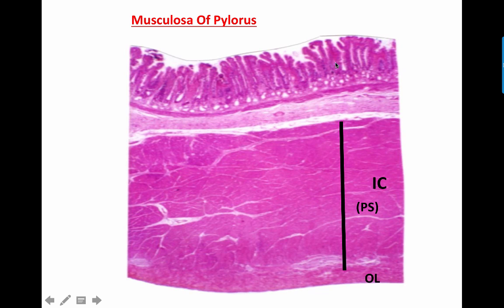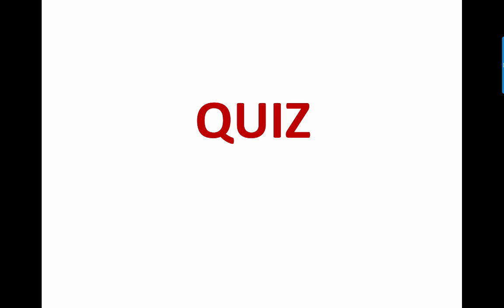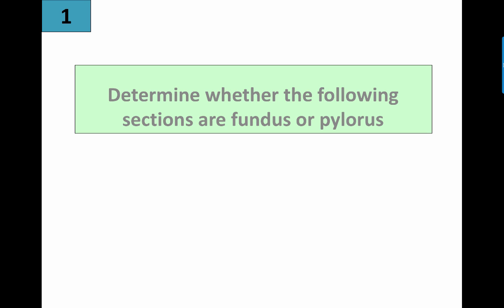A full picture of the pylorus shows: mucosa with pits and glands, muscularis mucosa, submucosa, and the muscularis. In the muscularis, there is a thick inner circular layer because it forms the pyloric sphincter, plus the outer longitudinal layer. There is no inner oblique layer at all in the pylorus. The inner circular layer is much thickened due to its role in forming the pyloric sphincter.